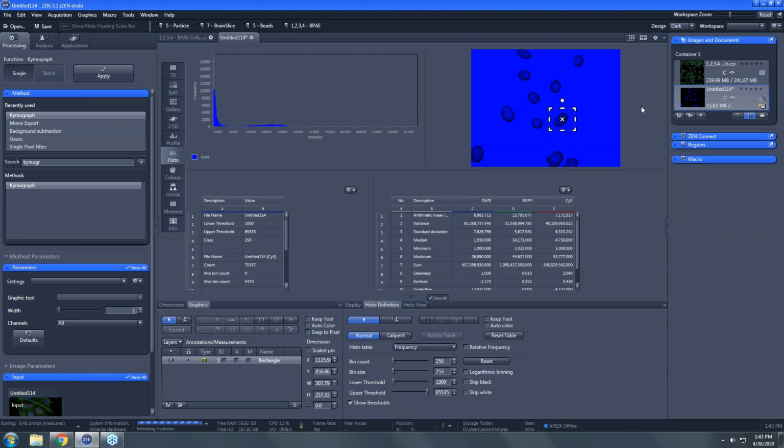The displacement you take from the original image, but there is no time scale, so you have to know your frame time when you calculate the velocity. You can do that by adding a timestamp to your original data and looking at what every frame takes. If it takes 30 milliseconds per frame, then every pixel you see on the Kymograph is 30 milliseconds. Hope that answered the question.